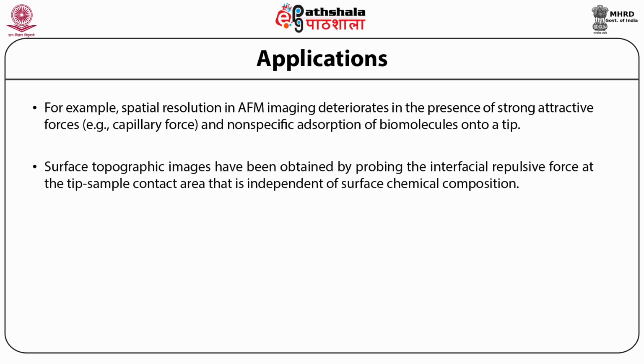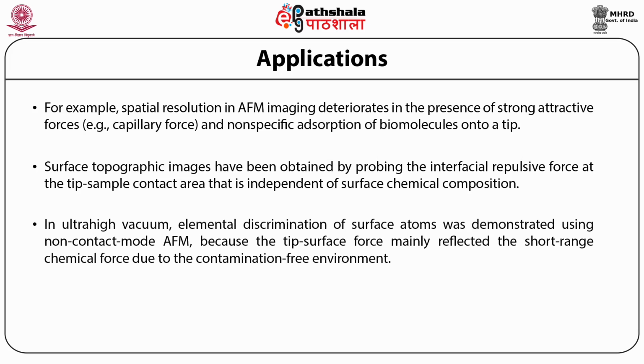Surface topographic images have been obtained by probing the interfacial repulsive force at the tip-sample contact area that is independent of surface chemical composition. In ultra-high vacuum, elemental discrimination of surface atoms was demonstrated using non-contact mode AFM because the tip-surface force mainly reflected the short-range chemical force due to the contamination-free environment.